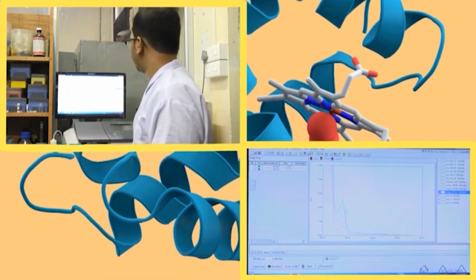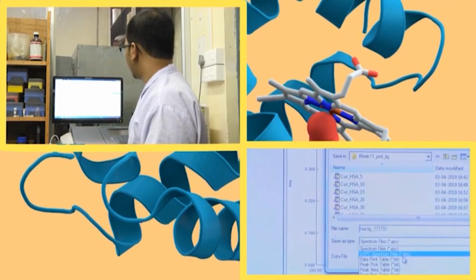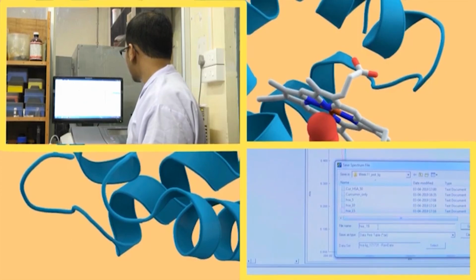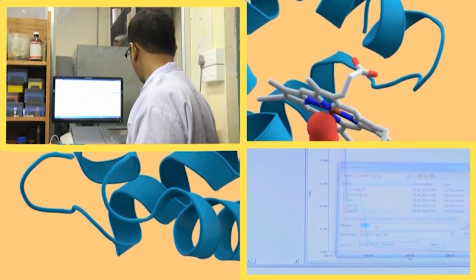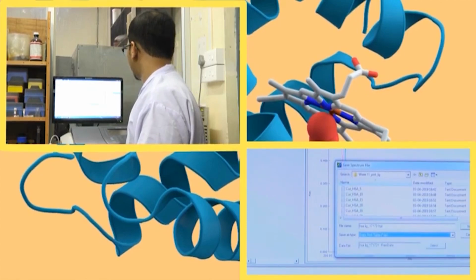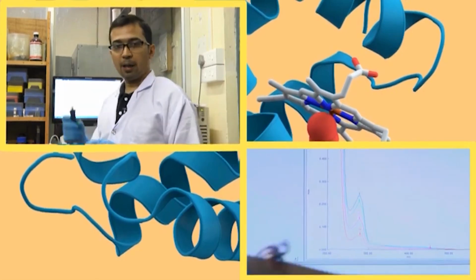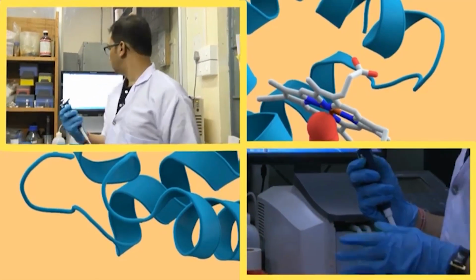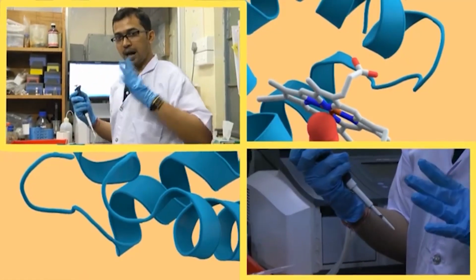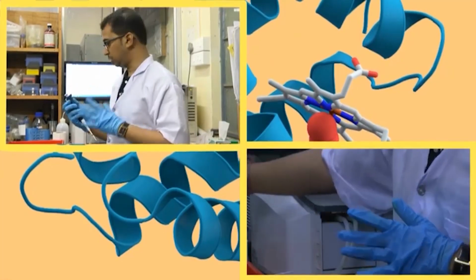So, out here we can see that again the absorbance value increases for protein. This is 20. Now, I am taking 10 microliter. Okay. Initially I had taken up to 20 microliter, so I am taking another 10 microliter, and the addition will give me a total of 30 microliter of HSA in the solution.